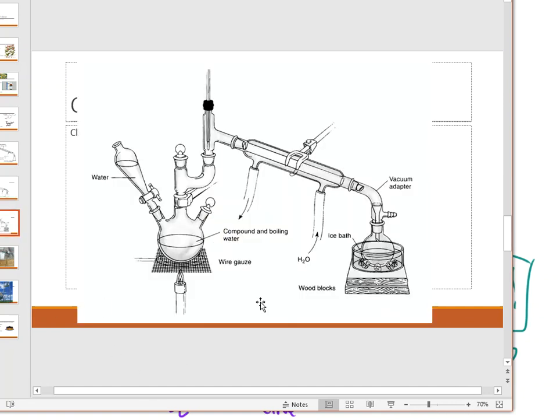And then finally, here's another steam distillation setup. So we see a separatory funnel that's used here again, and that has some water source. You're going to heat this solution up in the 3-neck boiling flask, and that water is going to be hit with some steam. The water gets hotter. The steam makes the eugenol vaporize and evaporate and go up. This is a connecting neck and the sidearm neck, and that goes into a condenser, which then goes back down into a receiving flask, and they've used an ice water or ice bath over here. So same type of setup, no difference at all.